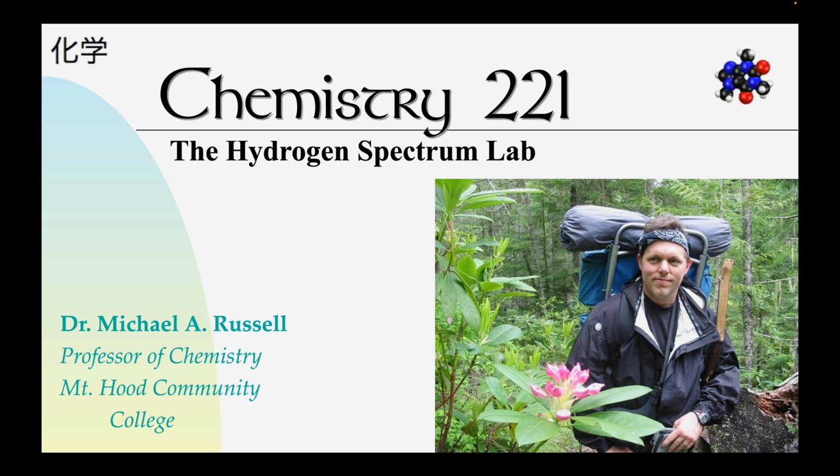People oftentimes think that chemistry is all about adding one chemical to another and seeing what happens. This particular lab is mostly about light and how the electromagnetic spectrum can help chemists to make transformations possible. But of course, you have to understand where all this stuff is coming from. So this is a fun lab, and I think you're going to enjoy it. Let's talk about what you're going to see.